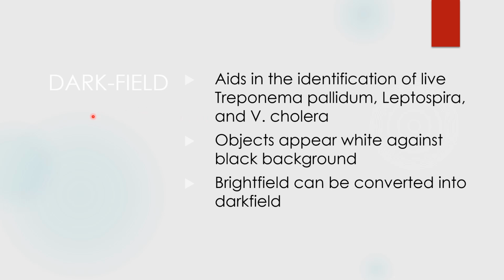Moving on, you have your dark field microscope. This one is used to identify live Treponema pallidum, Leptospira, and Vibrio cholerae. Your object in a dark field microscope will appear bright against a dark background. That is for your dark field.